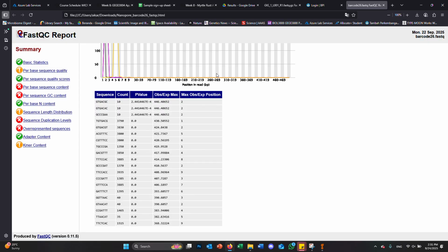Yes. Okay, so let's get started on our own analysis. So what happened before you got here? As I said, we called the reads. They were demultiplexed into each of the individual barcode samples. So you all had your individual barcodes last week.